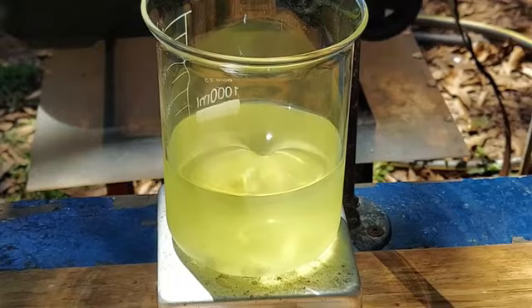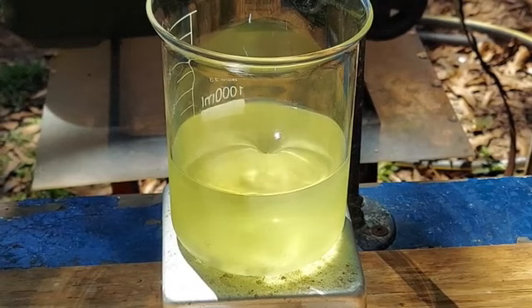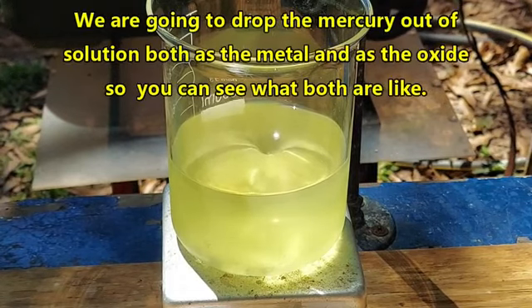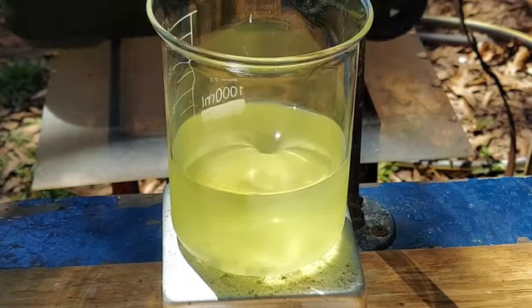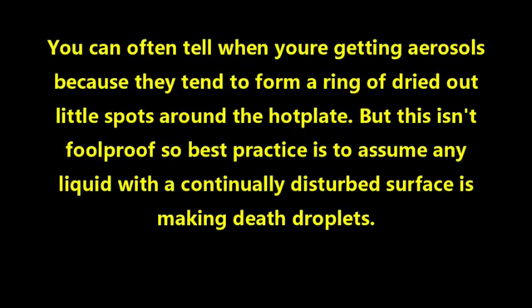All right, so we are at a point where we are ready to start reducing the mercury down to the metal. Now, the reason that I was hesitant about going this way, and I didn't decide to just do this by default from the word go, is because borohydride reductions tend to produce fizzage, right? If it fizzes, then it is producing aerosols. And aerosols that contain mercuric ion or little bits of elemental mercury are going to be very dangerous.